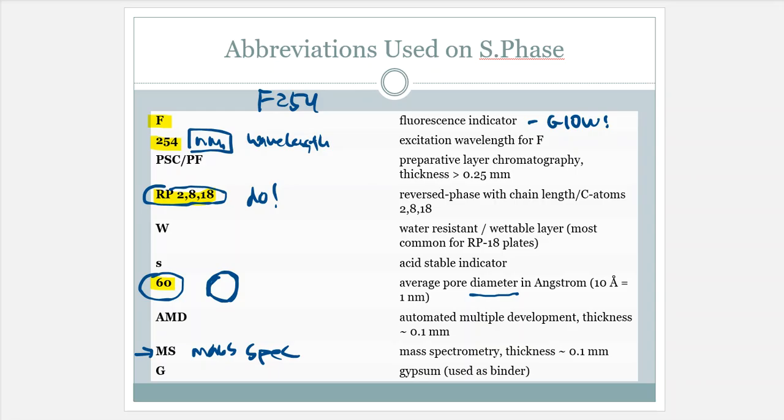And when it does that, we can get some mass spectra data on that particular component. So we can still do mass spec on HPTLC, believe it or not, but we need some modification to that equipment, and currently we do not have that in-house. We probably never need that in-house, but who knows? Maybe one day we'll look up and we'll get one. I don't know, but that is an option of things that we can do.